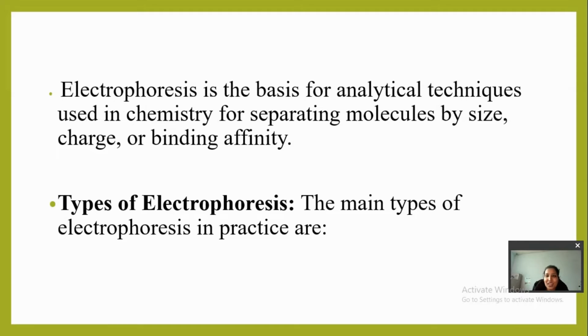Electrophoresis is the basis for analytical techniques used in chemistry for separating molecules by size, charge, or binding affinity. So, in electrophoresis, we separate the molecules based on their size, charge, or binding affinity.